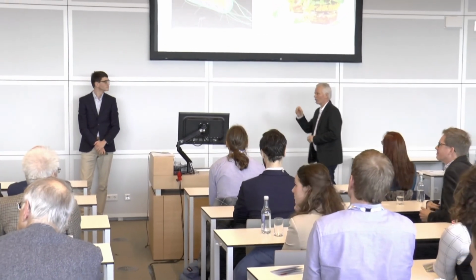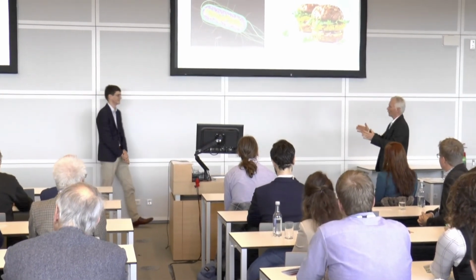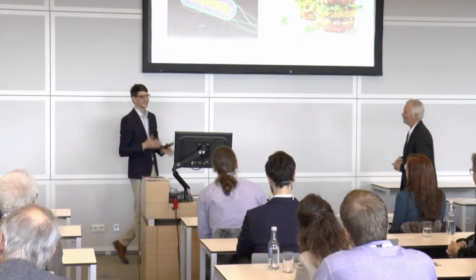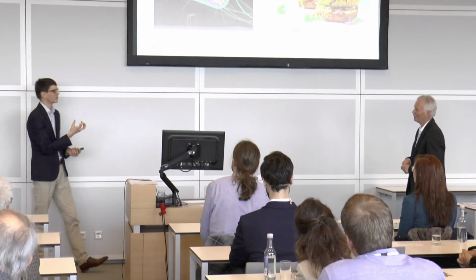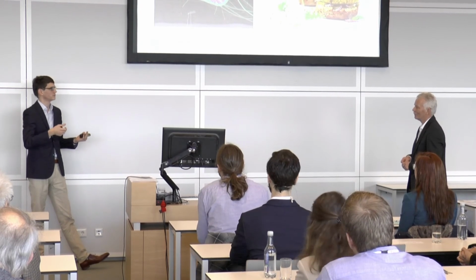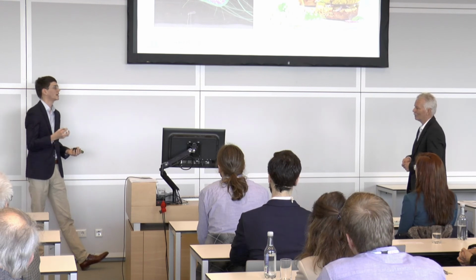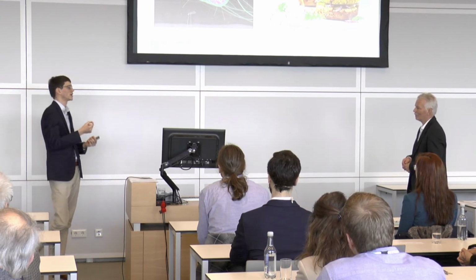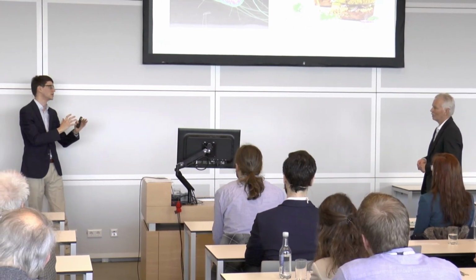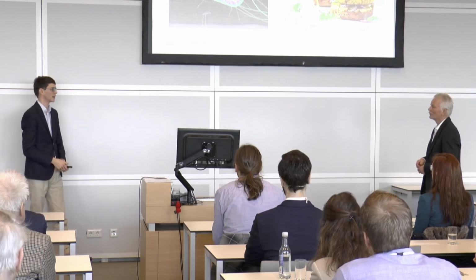So you are looking at a single molecule, yes, but the light beam is much broader, yes, and so the number of molecules in that light beam will be millions. No. How we do it, especially in life, this is very difficult. We actually have fluorescent proteins that are like a light bulb, which we normally just switch off. And then we have hundreds of light bulbs that are all switched off. But then, using very high energy light, UV light, we can stochastically switch only one of those light bulbs on. And then we know for sure that the light is originating from a single protein, from a single molecule, and from there we can actually identify where it is located.